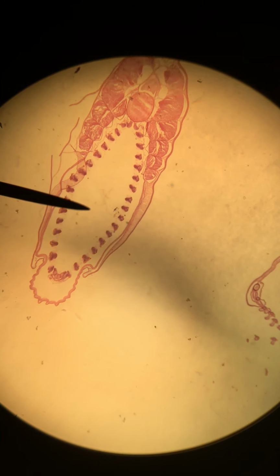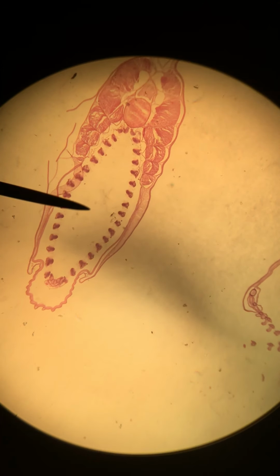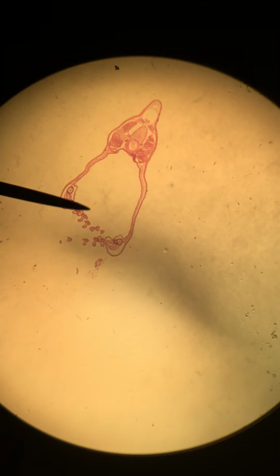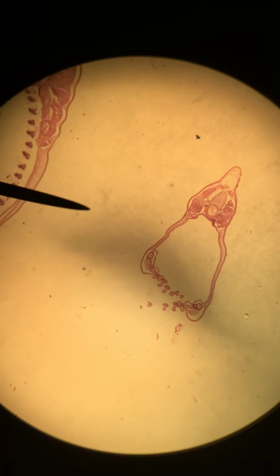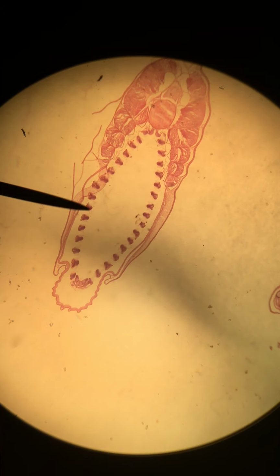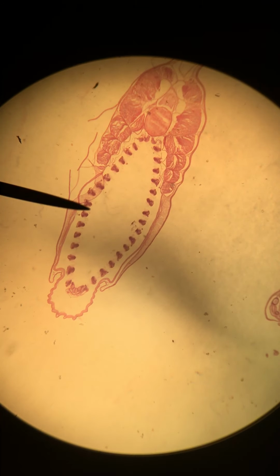This nice round structure here in the middle is the pharynx, and it's now in place of where our oral cavity, our buccal cavity, was in the last slice. So the pharynx has taken shape, and of course all of these little structures are our gill bars and gill slits.